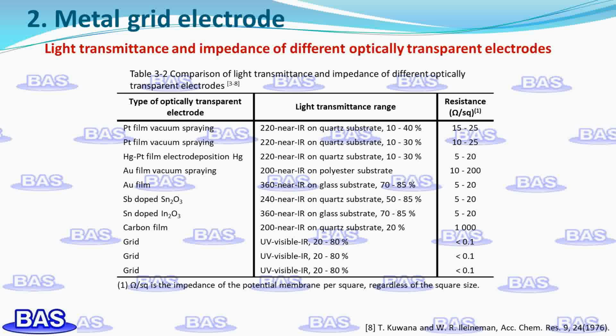One of its disadvantages is the non-transmissive nature of the metallic wires, which obstructs the observation of adsorption phenomena using perpendicularly incident luminosity. Another disadvantage is the complicated diffusion behavior in spectroelectrochemical experiments performed in a short time.